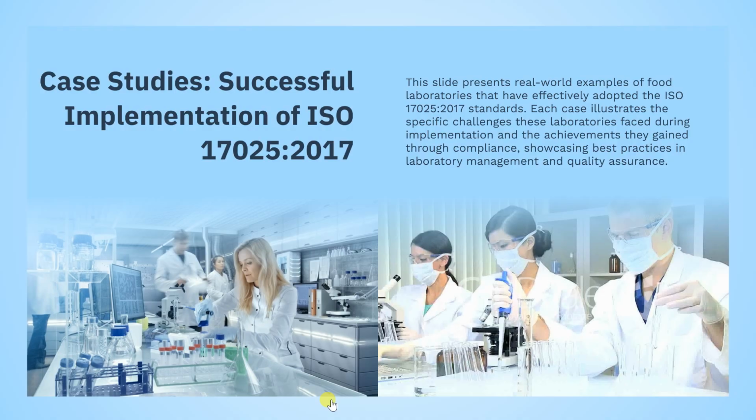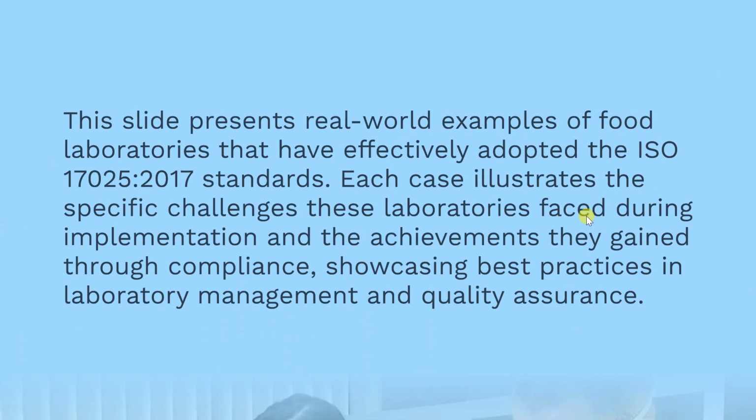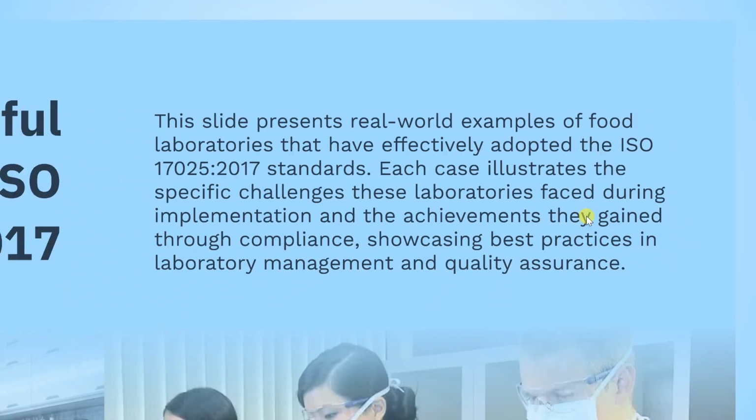Now, this slide represents real-world examples of food laboratories that have effectively adopted the ISO 17025 standards. Each case illustrates the specific challenges these laboratories faced during implementation and the achievements they gained through compliance, showcasing best practices in laboratory management and quality assurance.